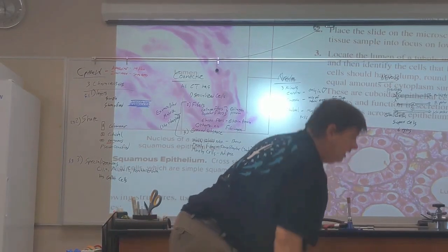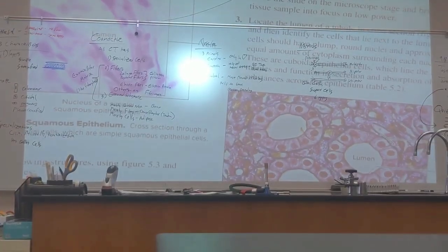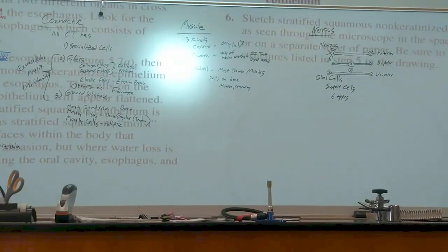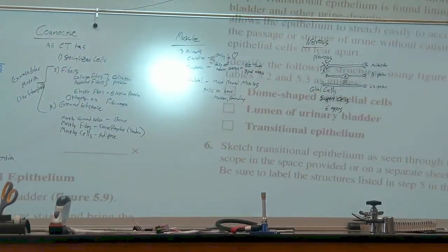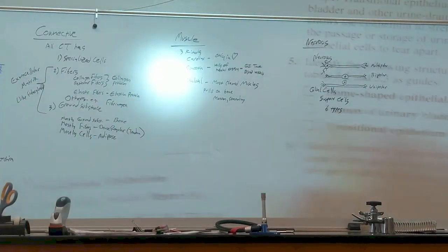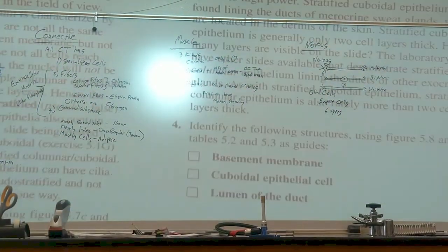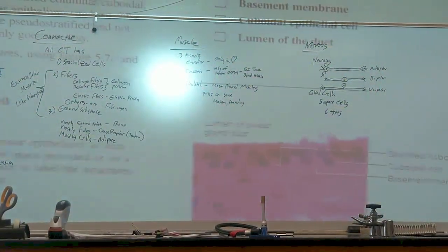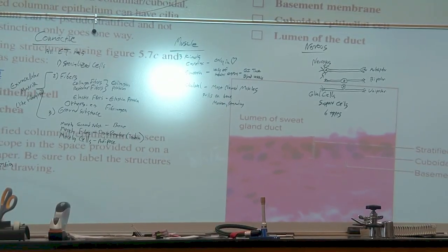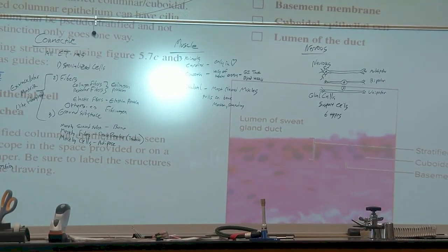Now, let's go for some pictures. Are you with me? Nobody's like, woohoo! Okay, but we're going to try it anyway. We'll see if they have a picture I like. Well, they have some pictures, but I'm sure not liking them. This is stratified. We could go for simple. These are definitely squamous, but these in your lab book on 98, I'm trying to focus to get better. Let's darken it up, see if that helps. No, let's go lighter. Does that help? Yeah, lighter helps a little.